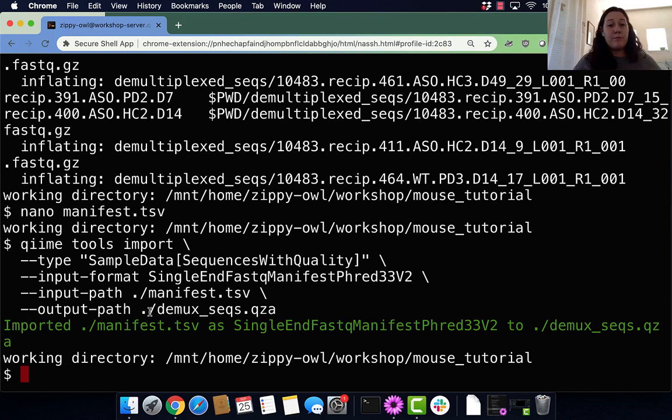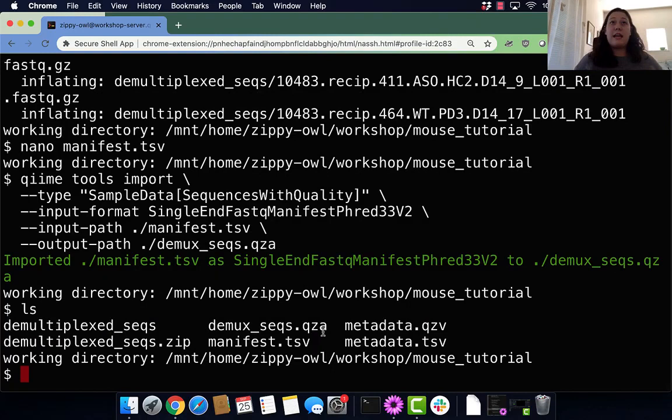Our input path is the manifest.tsv file, and we tell QIIME where that is. Then we tell QIIME we want it to output our demux.qza file. Now that is all imported. Let's ls and we can see that demux_seq.qza file. We have data, it's imported, beautiful.